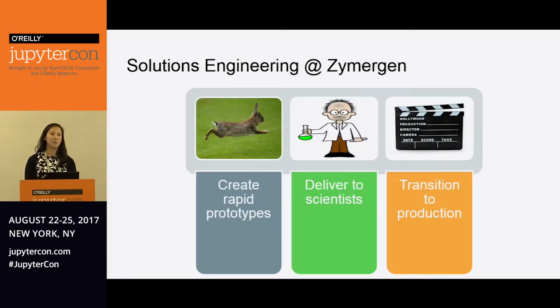So you're probably wondering what a solutions engineer is. I know that term probably means a lot of different things at different companies. But at Zymergen, what it means is that we create rapid prototypes that we deliver to the scientists, and that eventually, if the tools are adopted, they'll get integrated into our production code.